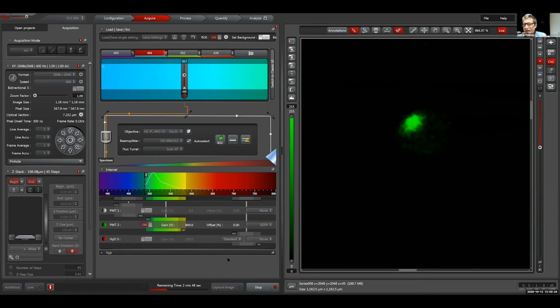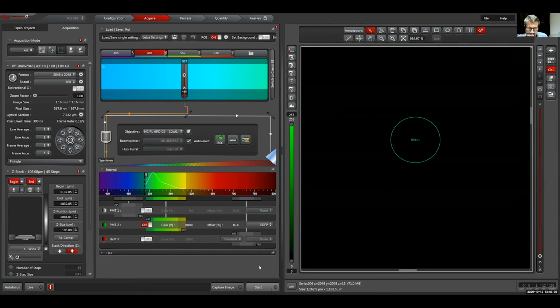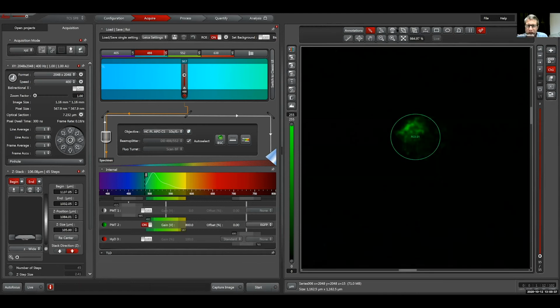I cared about a before and after picture. I don't care about the cell itself picture. I just care about the whole picture, right? Okay, now I am going to select all of them and just delete it.